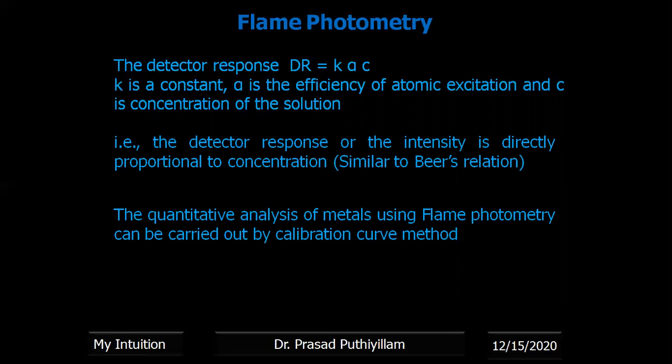For quantitative analysis, not only quality but quantity, how much amount of the metal is present in the solution, can be determined using flame photometry. It can be carried out by the calibration curve method.